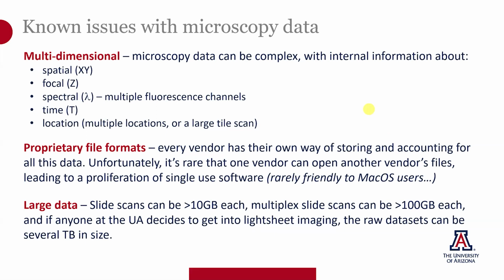And while we don't have anyone that is hardcore into light sheet imaging yet, raw data sets in light sheet imaging can sometimes be several terabytes in size. And there's things like high content screening as well, which can create a lot of data.